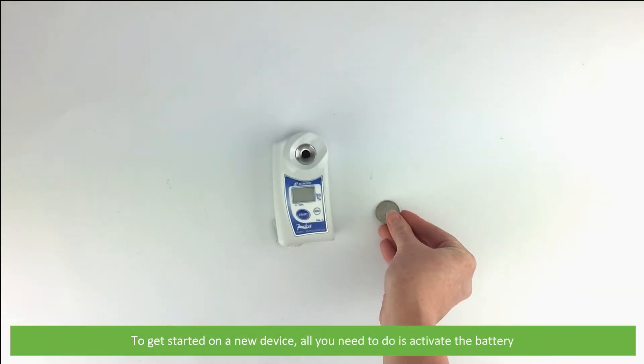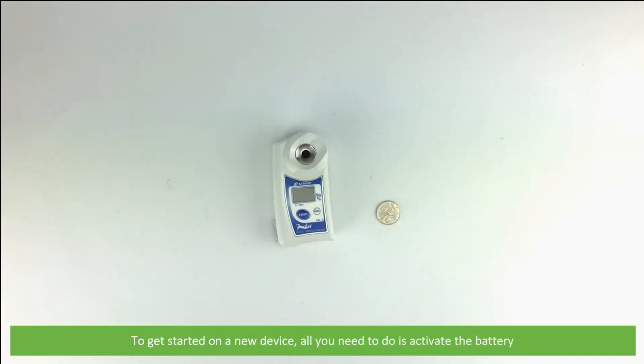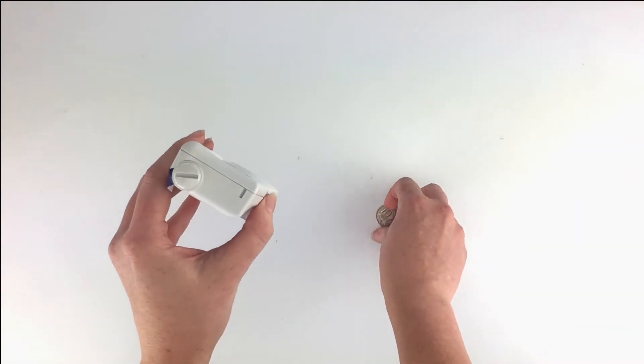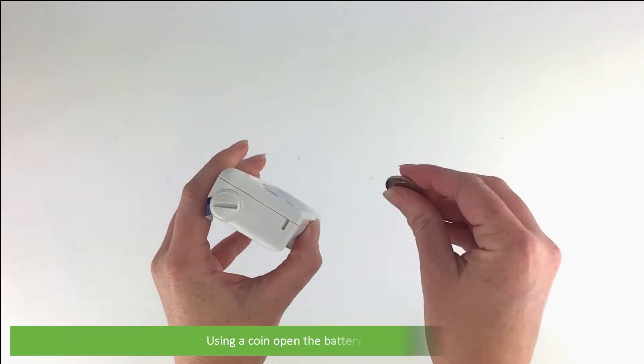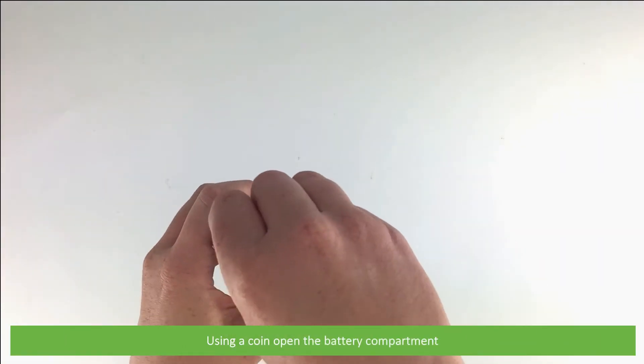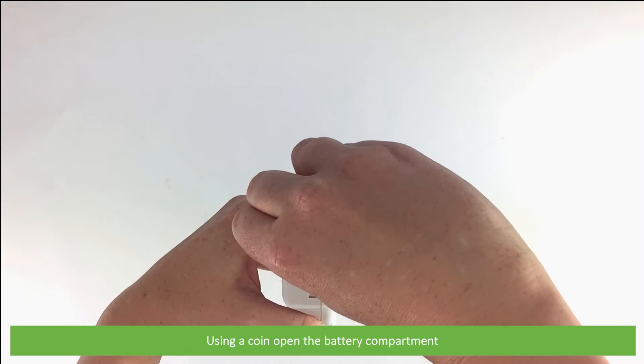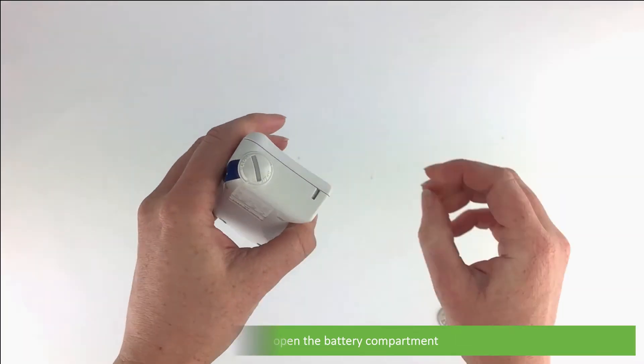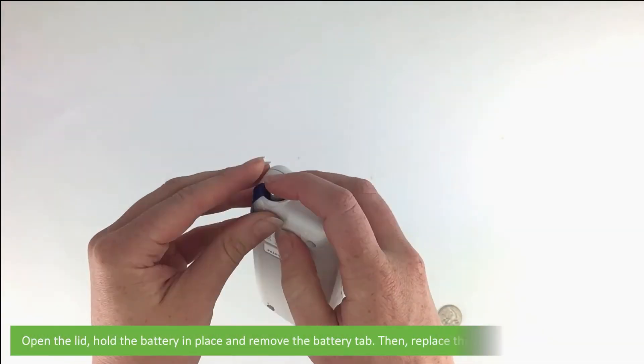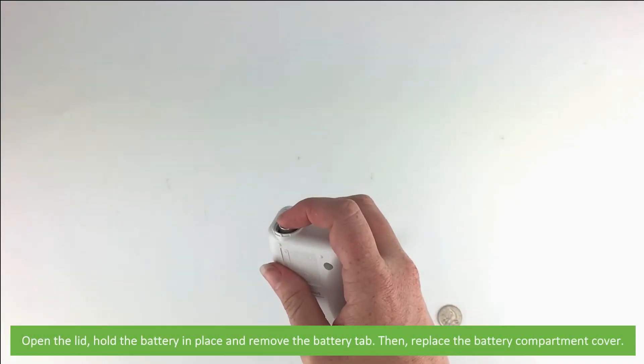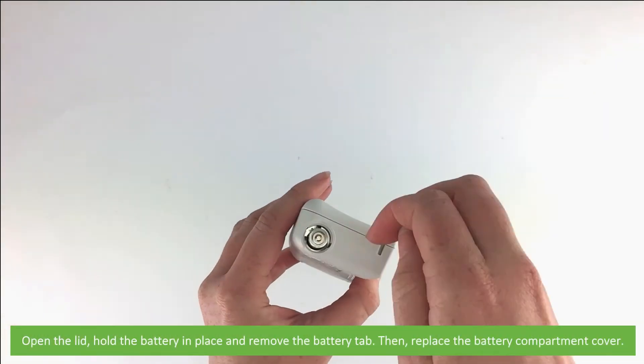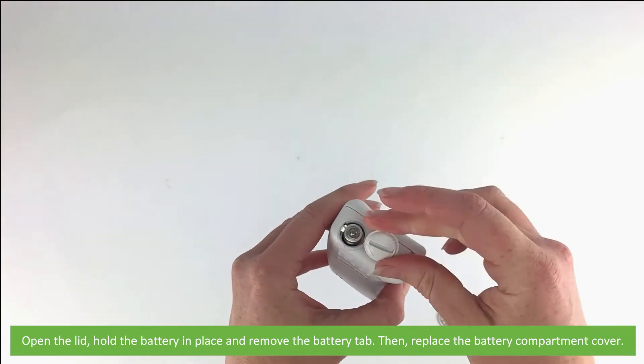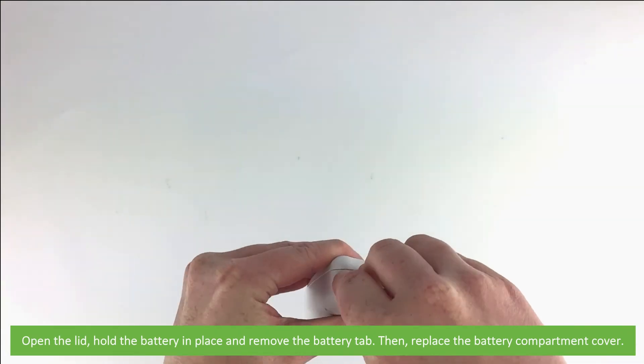To get started on a new device, all you need to do is activate the battery. Using a coin, open the battery compartment, open the lid, hold the battery in place and remove the battery tab. Then replace the battery compartment cover.